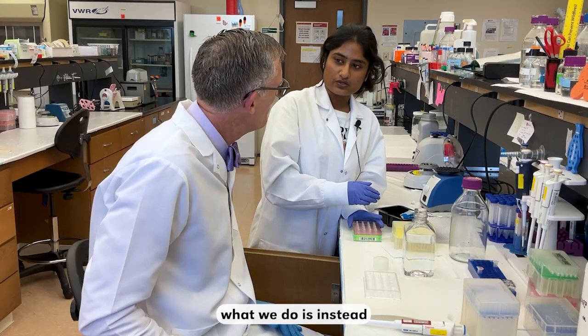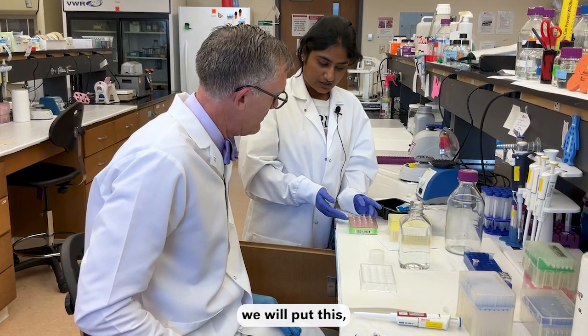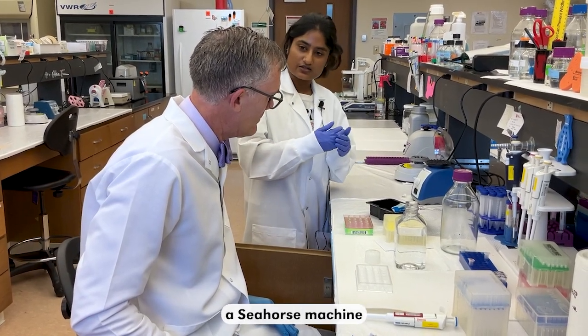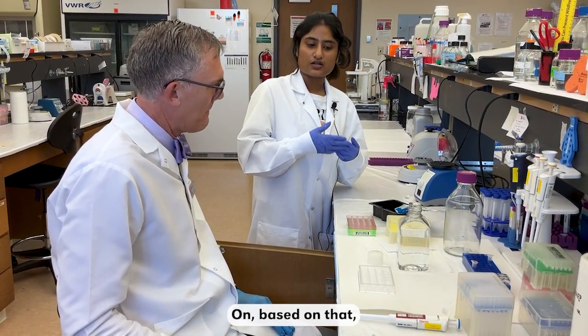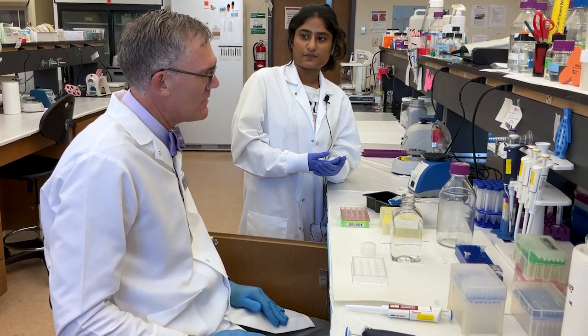Instead of this hydrating medium, we will put this cartridge into the cells and place it in a Seahorse machine, where it reads the value of how much oxygen the cells are consuming. Based on that, we will know how active the cells are and how many cells there are.